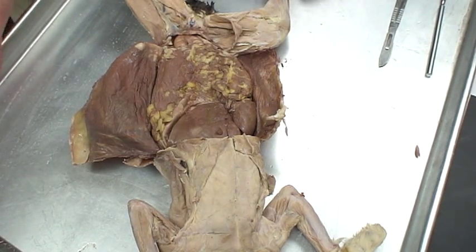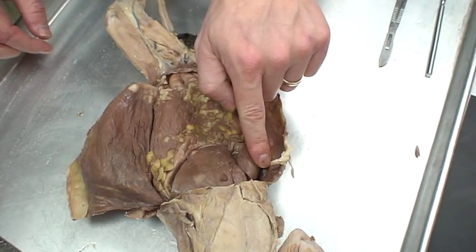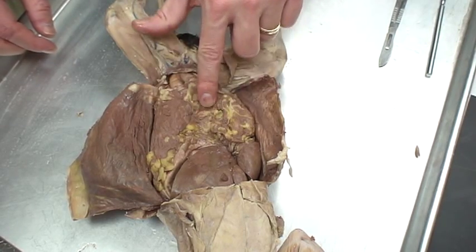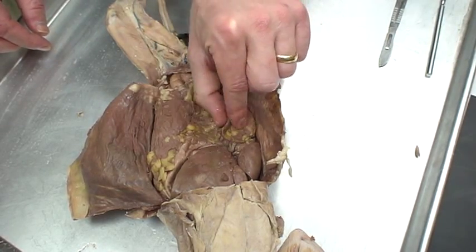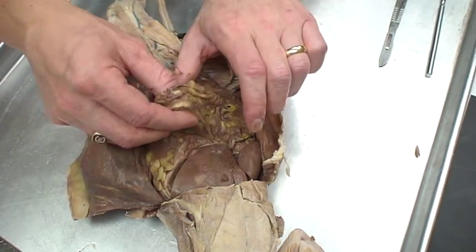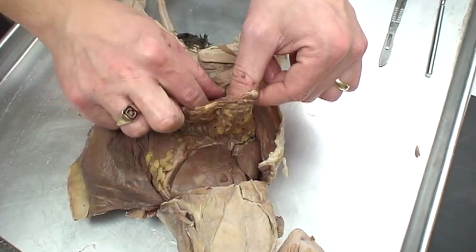A lot of students at this point say, what is this? What we're seeing is the liver up here, the spleen on the side, and a mass of yellowish stuff. This is actually a membrane that lifts right up. This membrane covers the intestines and ties to the bottom of the stomach. This is all called the greater omentum.